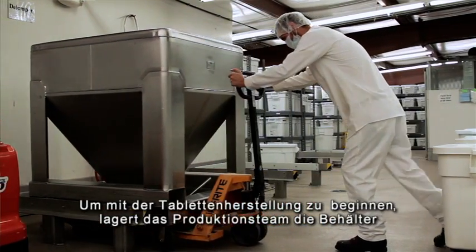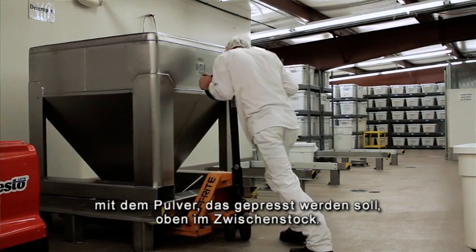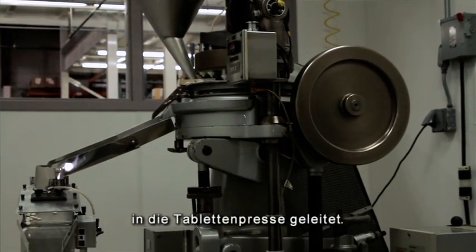To begin the tableting process, production will move the containers of the powder to be tableted to a staging area upstairs in the mezzanine overhead. From there, the powder is gravity-fed into the hoppers on the tablet press.